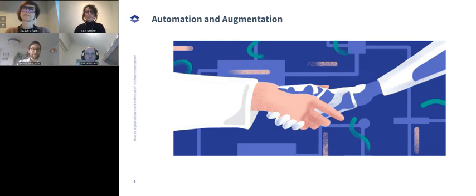The point now is you come to a term that I use often, a digital workflow, because your scientific discovery workflow needs some kind of digital representation. The bigger your automation is, the more you want to drill down, and the closer you want to go to the detail of your automation island, the closer you come to manufacturing. Then your digital lab assistant can actually be powered again by a keyboard and a mouse.